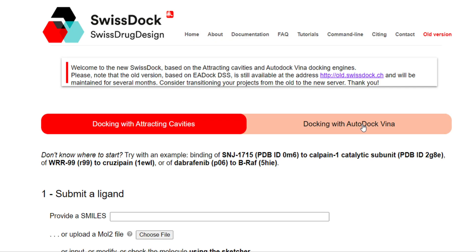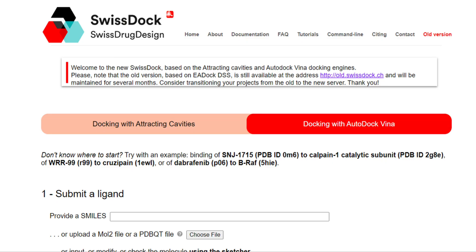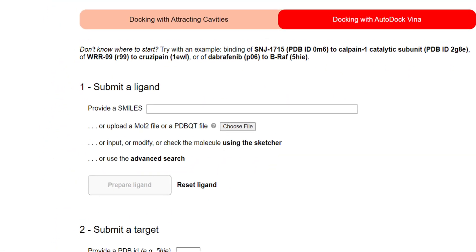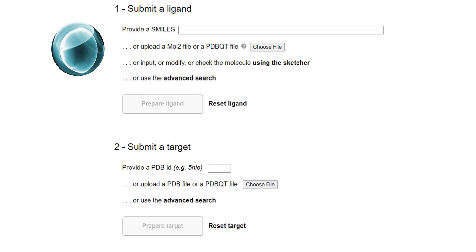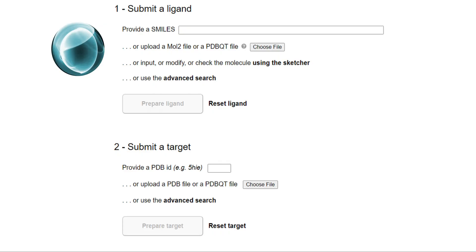When you click on that option, after a few moments the interface will change, and docking with AutoDock Vina will be highlighted in red. Once the interface has changed, please scroll down. You will see two options: the first is to submit a ligand and the second is to submit a target protein structure. To submit the ligand, you have three options: you can submit the SMILES, upload a MOL2 file, or upload a PDBQT file prepared using MGLTools. We recommend going with SMILES.